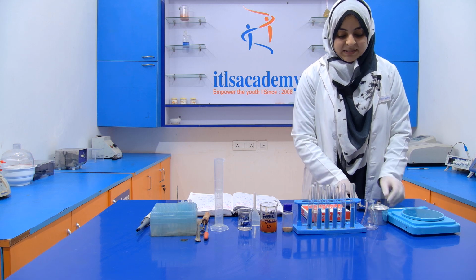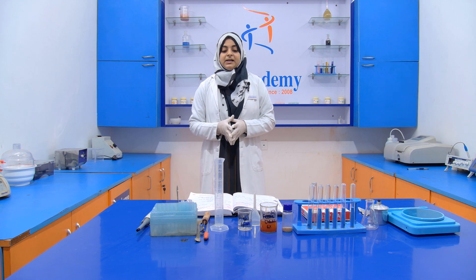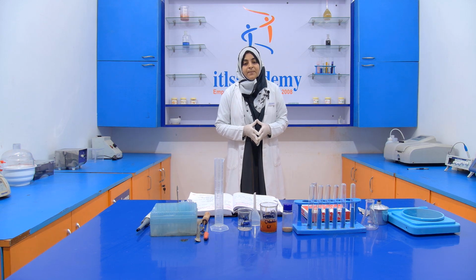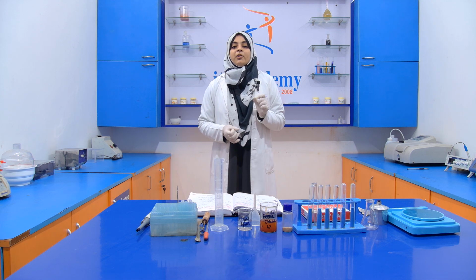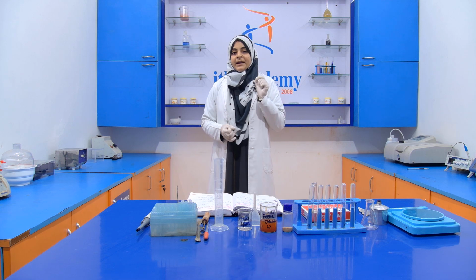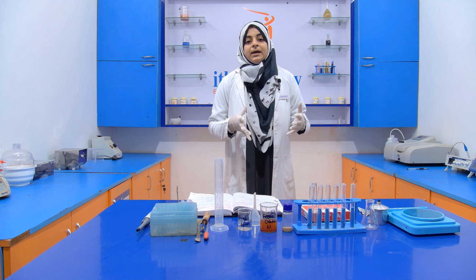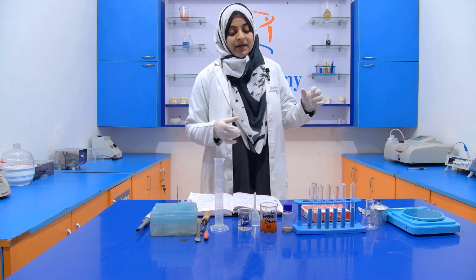Now how you perform the experiment is very simple. We take 1 gram of Asafoetida and dissolve it into 6 ml of rectified spirit. After that we filter it using filter paper, and then we take 5 ml of the filtrate, and into 5 ml of that filtrate we add 1 to 2 drops of ferric chloride. If foreign resins are present in the Asafoetida, then our solution turns olive green, which indicates the presence of foreign resins.